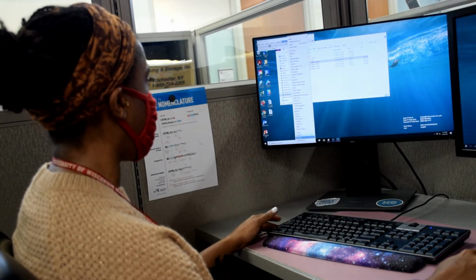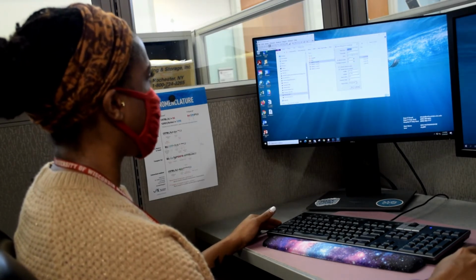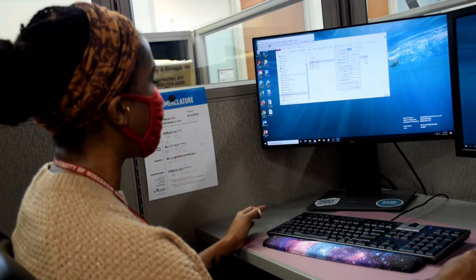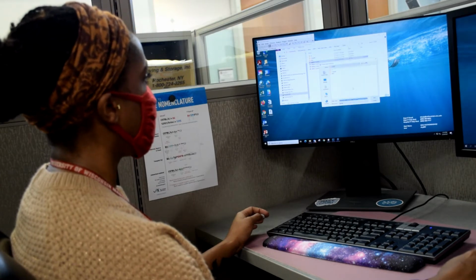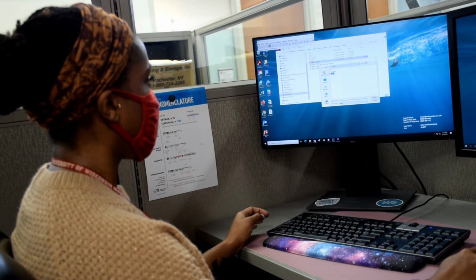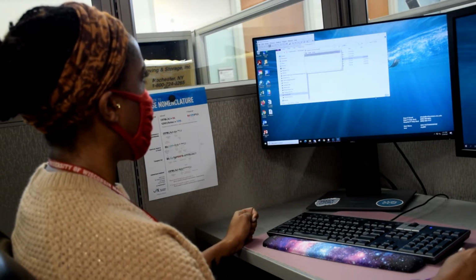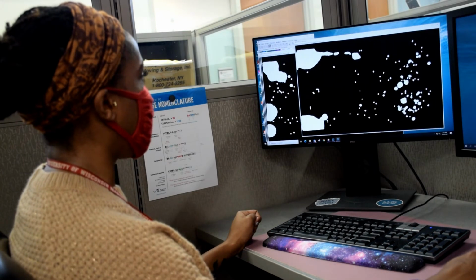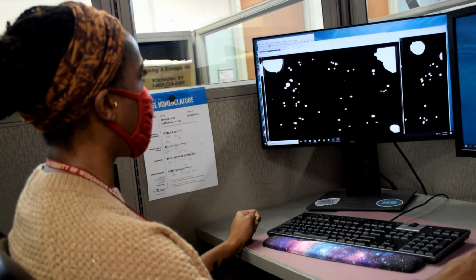Now we select our next software plugin, and that is the Void Wizard. Now this is really cool because this is where it's going to give us a perfect analysis of all the images that we just set with our pixels. We select a folder that we want it to look in. And now here it's running and analyzing each of the images. And now in this case, it did its own recorrection of all the spots. So now they're nice and clean and perfectly quantitated.